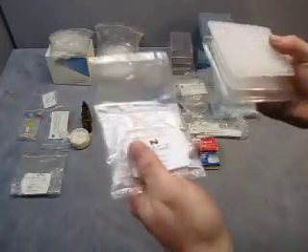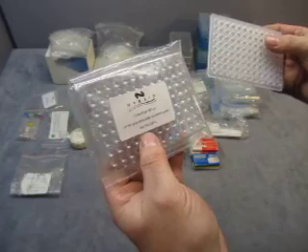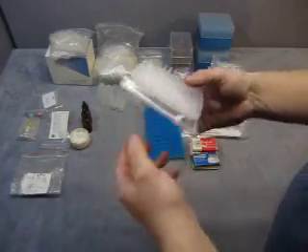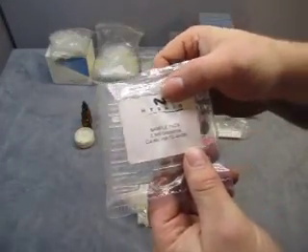Then you get Omni tube caps. And then an Omni Plate 96 lid, and then another one — same thing, 96-well lid. Then we have a sample pack of Omni strip.